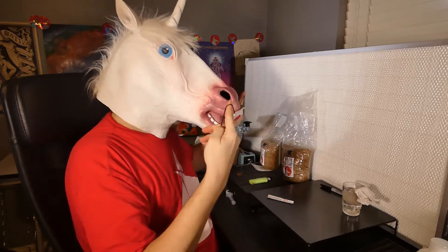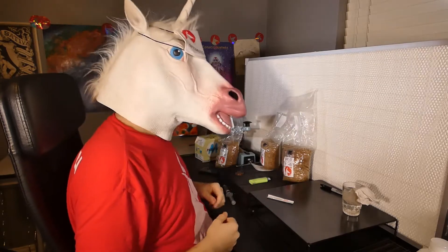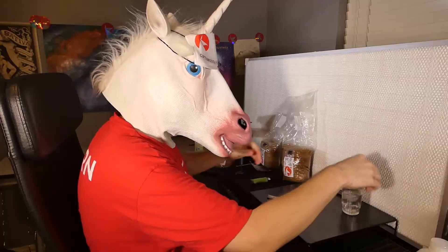When dealing with microorganisms, it's always a good idea to wear a mask, even when working in front of a flow hood. Be sure to sterilize your hands and work area with alcohol before proceeding.